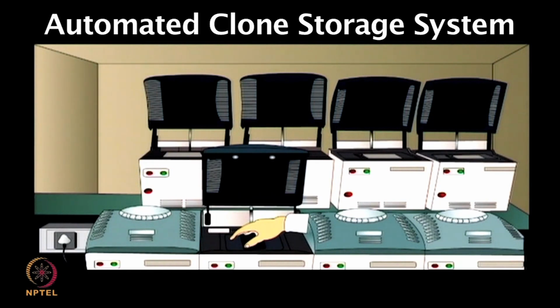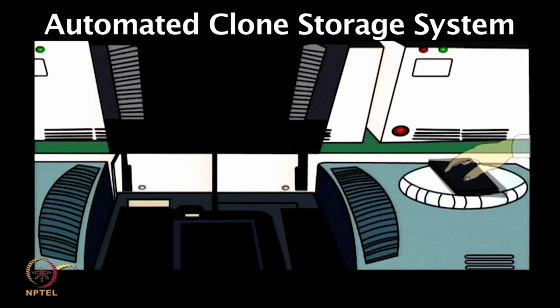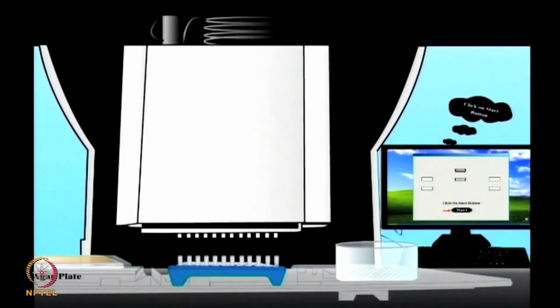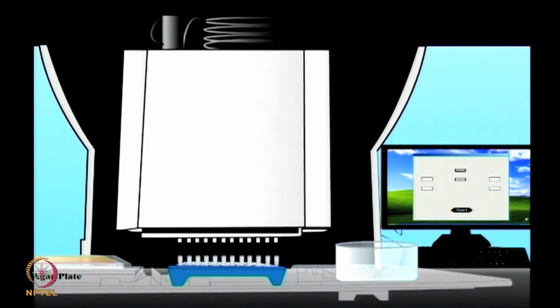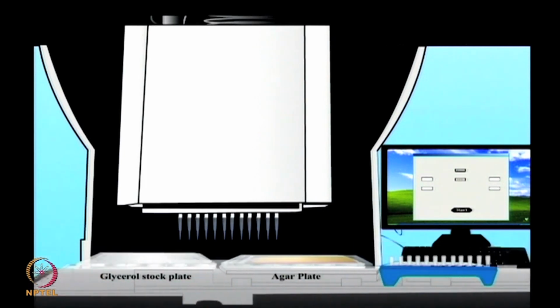This process is highly efficient and enables the transfer of many genes simultaneously into different expression vectors in a single step, in frame and without mutations. By using a recombinational cloning approach, the coding sequences can be transferred into any expression vector in a simple overnight reaction. After the cloning is done, perform the spotting of the glycerol stock on the LB agar plate. So, transfer the bacteria from the glycerol stocks to an LB agar plate that contains the appropriate antibiotic.